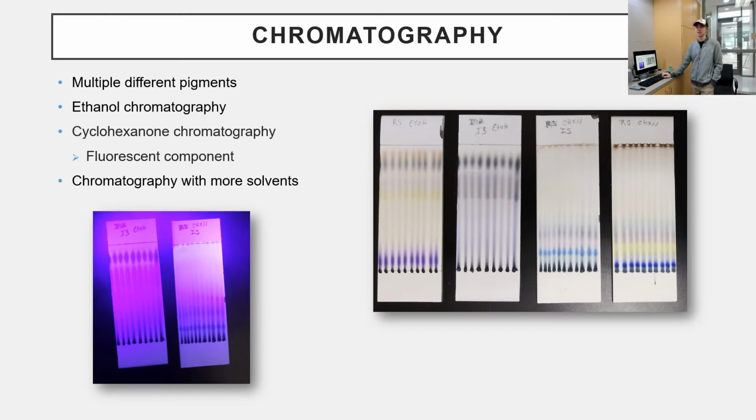I did that with cyclohexanone, with just nothing, and I saw a little band. It was really faint, but it was small. But there was some from the stabilizer. That's interesting. That went all the way. Yeah, that makes sense because it'd be soluble in that.